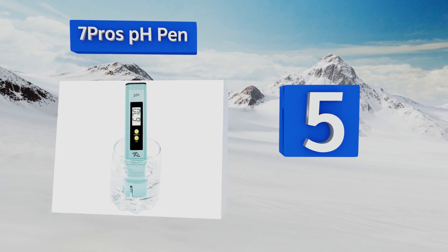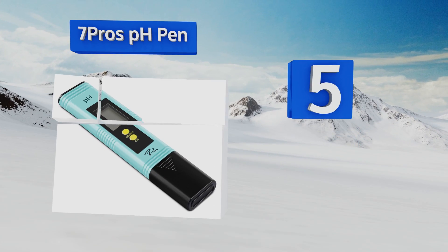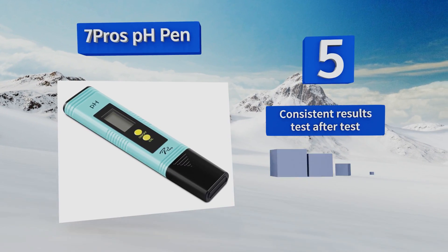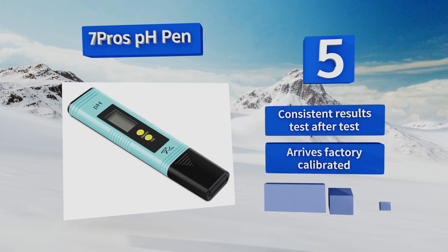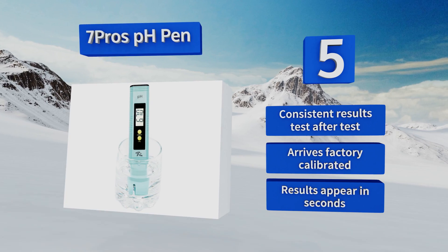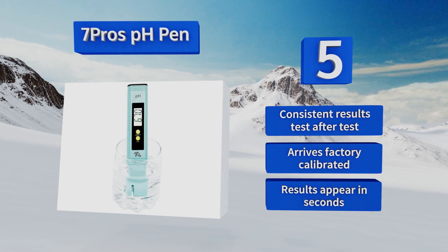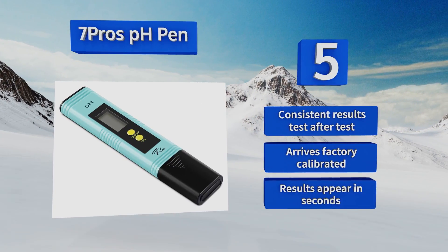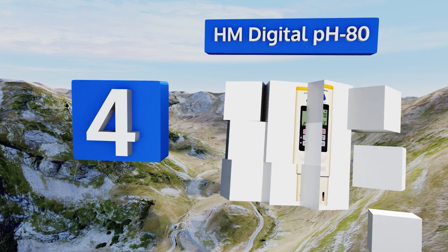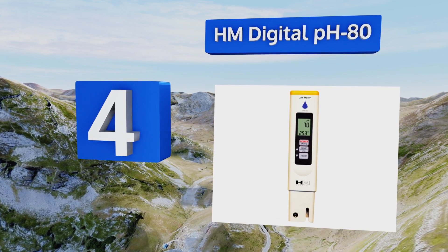Halfway up our list at number five, with just two buttons to worry about — an on/off button and a calibration button — the Seven Pro's pH pen is extremely easy to use for beginners but accurate enough for experienced growers. It also makes a great pool water tester for homeowners. It delivers consistent results test after test and arrives factory calibrated. Results appear in seconds.